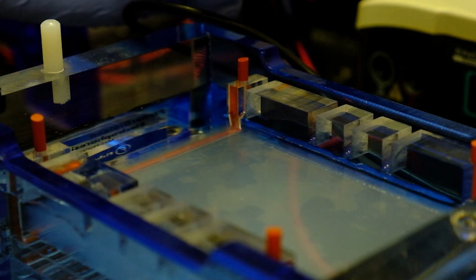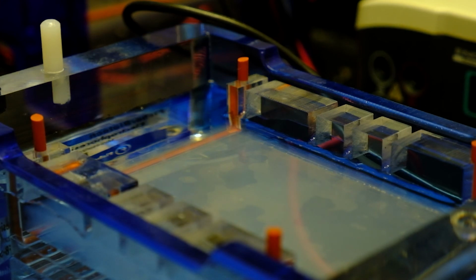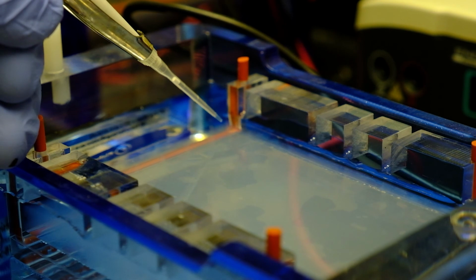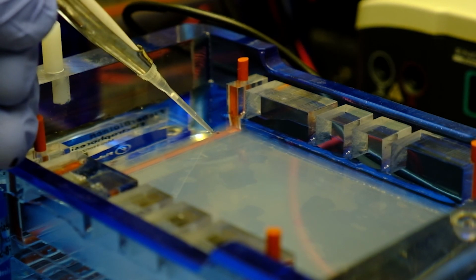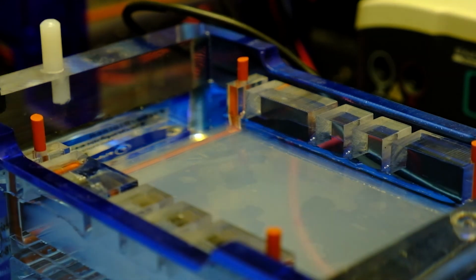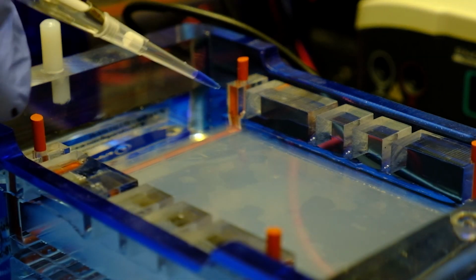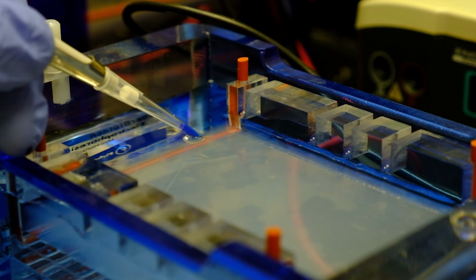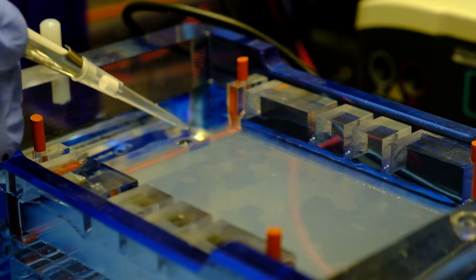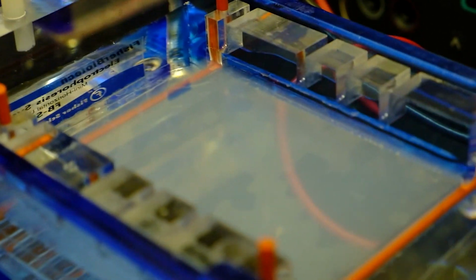And finally, we need to load the gel. I usually start with a ladder. You need to carefully reach right into the well with your pipette tip. Dispense the liquid slowly and it should go right to the bottom of the well. And do this for each one of your samples. Take care not to pierce the sides or the bottom of the well with the pipette tip. This is what a loaded well looks like from a different angle.